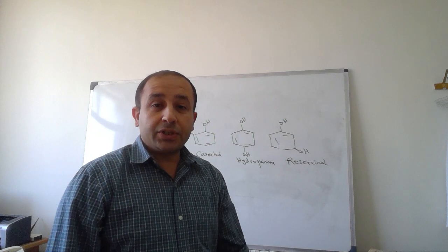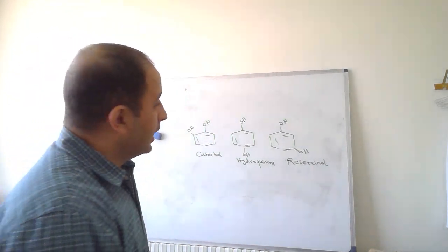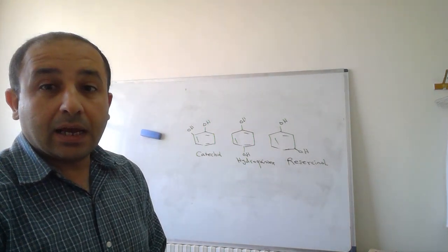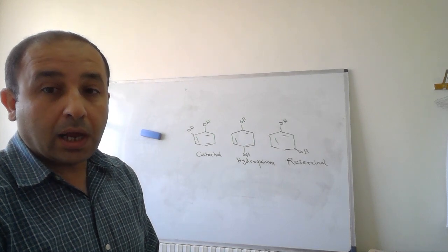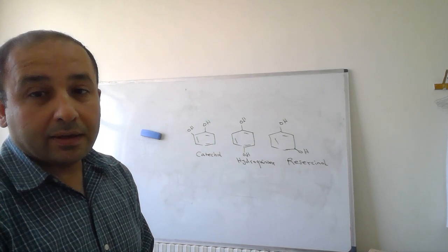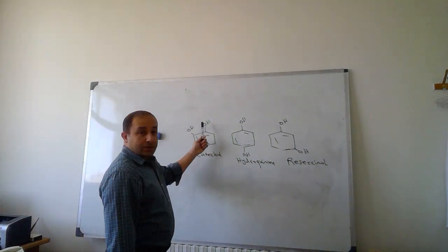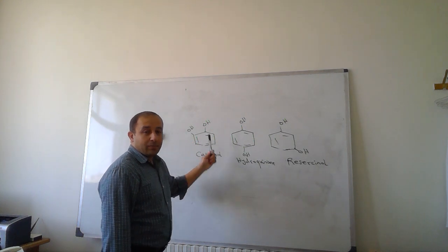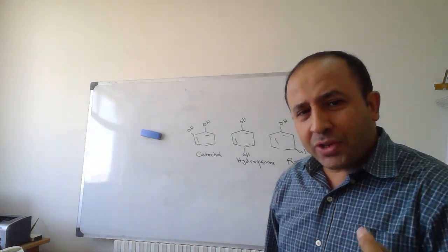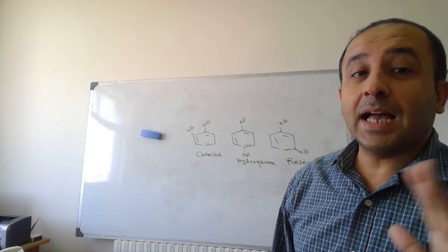In terms of partitioning, there's no big difference among them. However, the main difference is in intermolecular hydrogen bonding, or the interaction with other entities. Ortho-hydroxyphenol is busy with intramolecular forces, so there is a trivial chance for it to make hydrogen bonding with silanol.